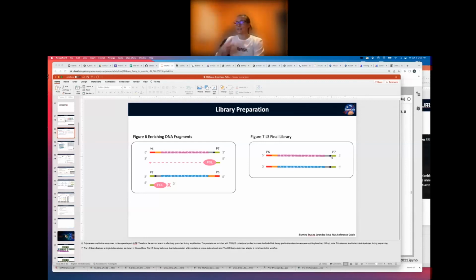And if it doesn't match up by more than 1 base pair, then it won't get identified as an adapter and it won't get removed. And that sequence for your index on your P7 is going to be different than the sequence. I know it's not here because this example is showing a single index, but another index here. And so that's why when it does the trimming, right?